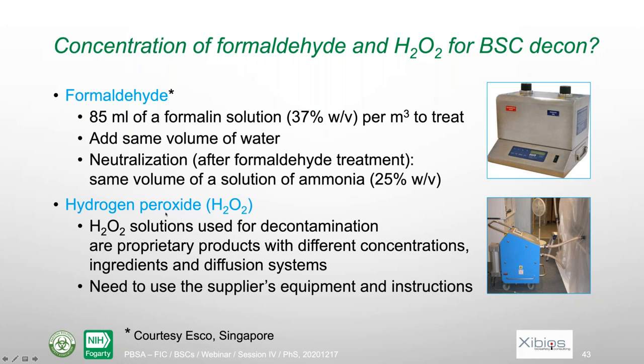For hydrogen peroxide, I cannot answer this question. Why? Because the H2O2 solutions that are used for decontamination are proprietary products made by specific suppliers and that have different concentrations of H2O2. They also have different ingredients that can be more or less pure, and there can be some acetic acid added and so on. Also the diffusion systems, like on the picture there, might be very different and can work on different principles. So the only way to proceed with H2O2 is really to use the supplier's equipment, like that diffusion device, and also use the supplier's instructions with respect to concentration. So there is no unique answer there.